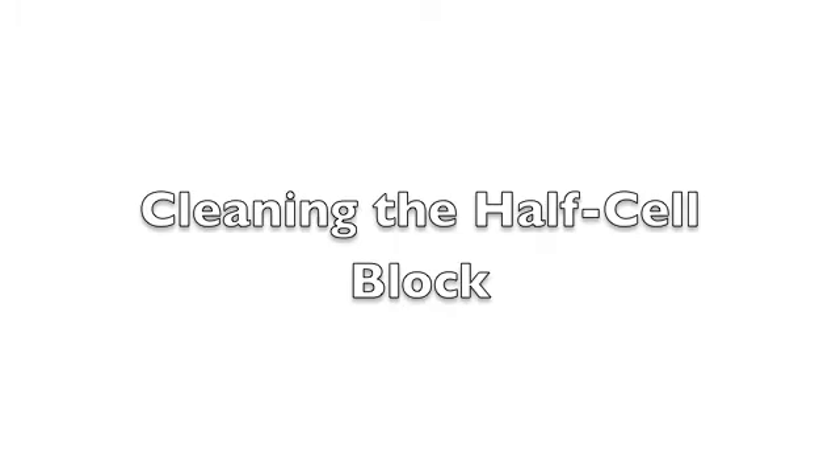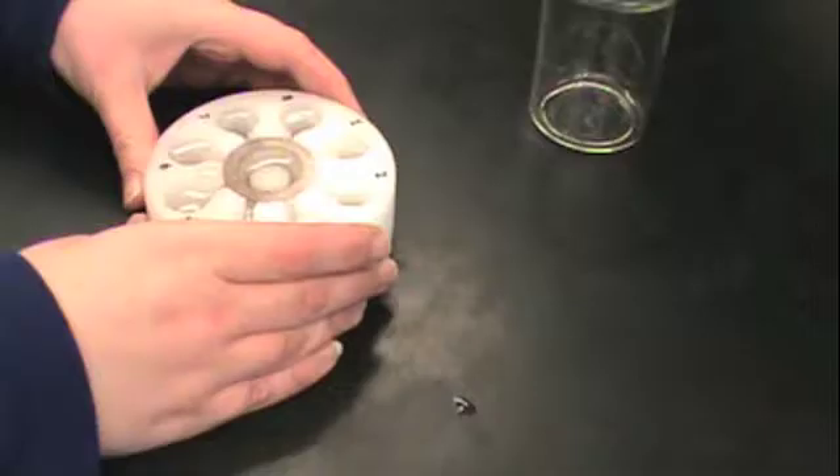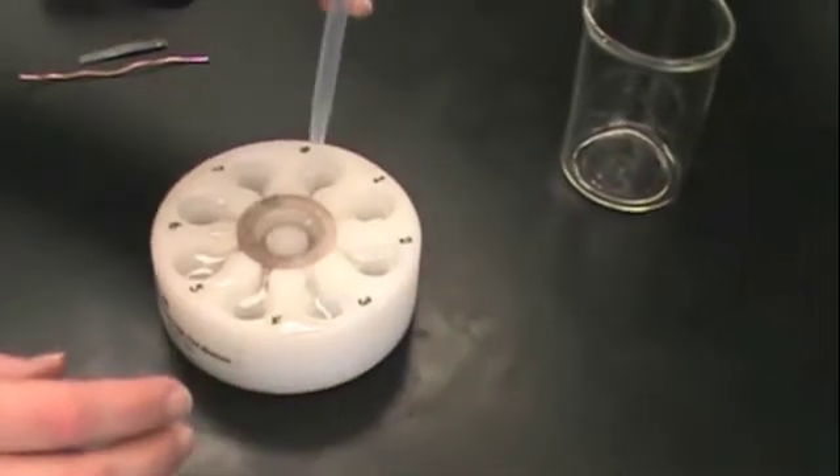In this video we will show you how to set up voltaic cells for experiment 12. The first step is to clean the half-cell block. Obtain the half-cell block from the hood and take it out of the bag.